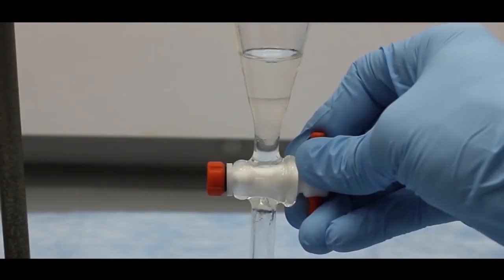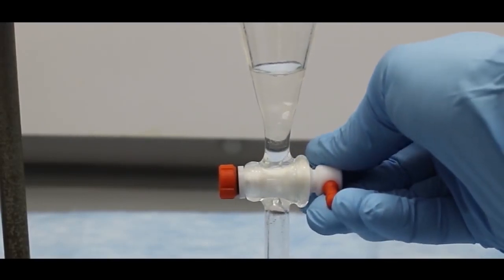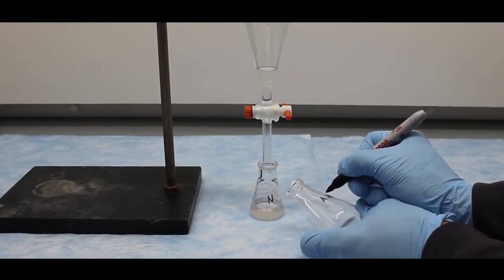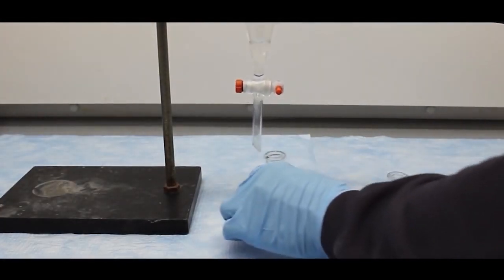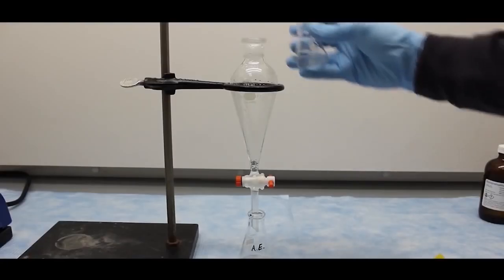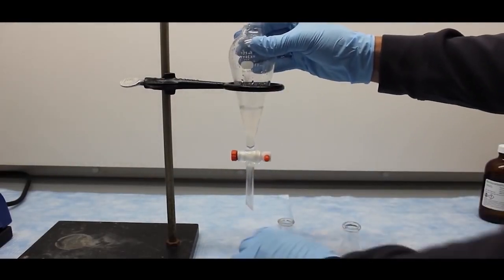And now I will just drain off the bottom layer, being careful not to get any of the top layer. I'm going to label a second flask AE, which will be the acidic extract or aqueous layer containing the HCl and the p-bromoaniline salt. I will drain the solution into the flask, close the sep funnel, and add back the neutral DCM layer so I can extract it one more time to ensure I get all of the p-bromoaniline out of it.